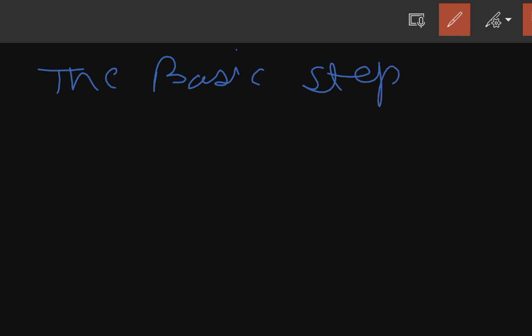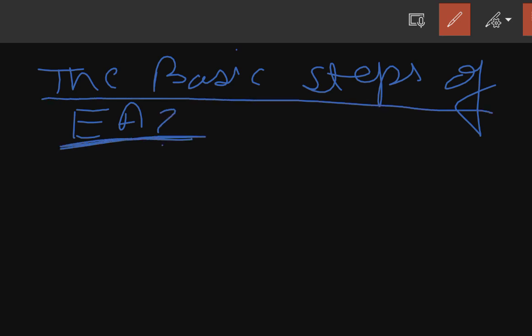I'm just talking about the basic steps of elemental analysis, that is EA. So what are the basic steps of EA?